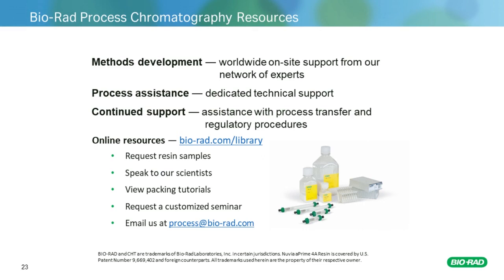Okay. I want to use calcium to promote target protein binding with ceramic hydroxyapatite. What concentration should I begin with? Well, actually, you don't really need a very high concentration. As I showed in the presentation, usually I would suggest you begin with 1 millimolar or 20 ppm. And you can also use it in combination with different concentrations of sodium chloride, depending on the exact interaction modes. Sometimes they work together pretty well.